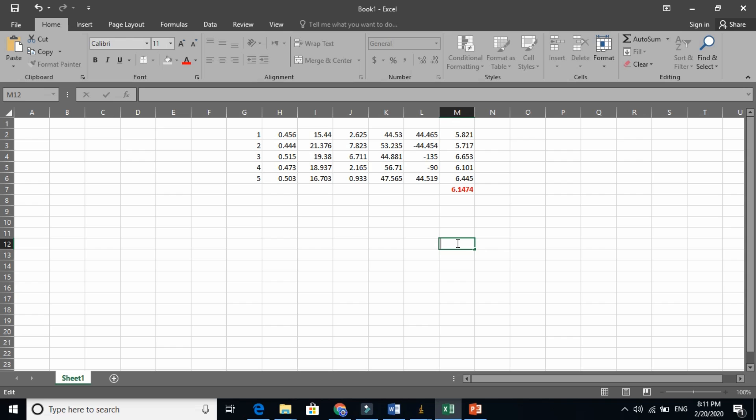So it is almost eight point something, eight point three nanometers. You see, it is almost same.